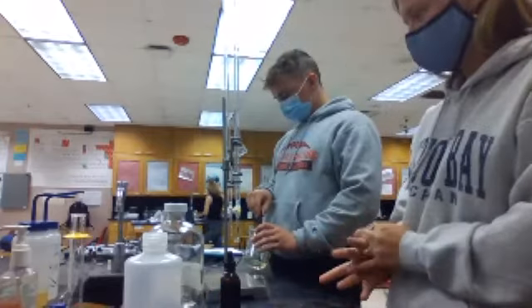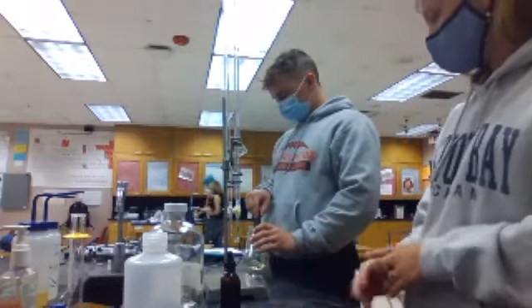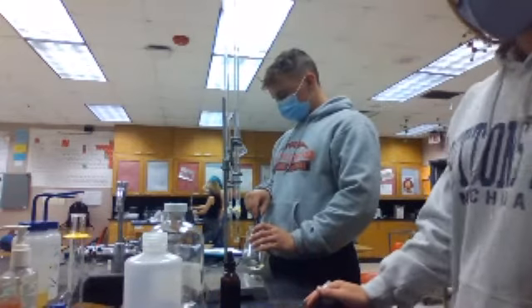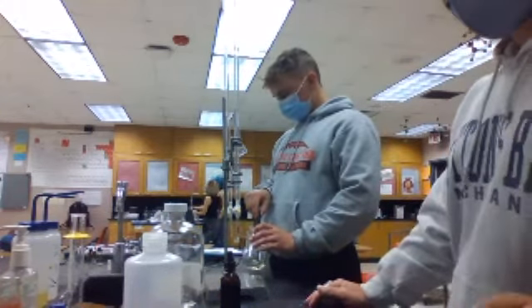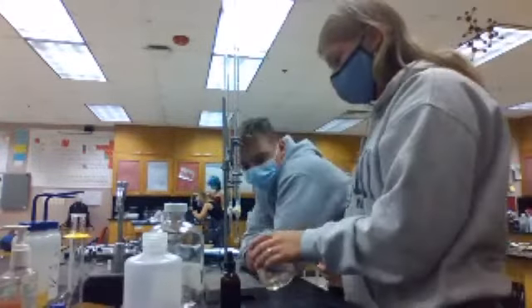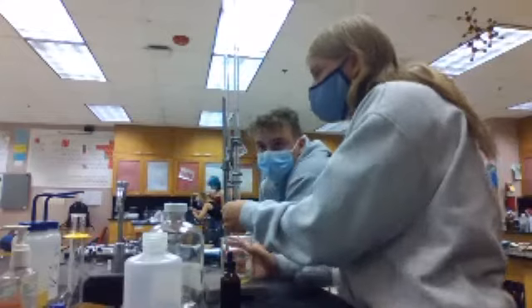Oh, no, hold on, it's still going up. It's still going. Keep watching. I know, it just went from like yellow to just. 1.27. 1.27 for 4 milliliters. And it keeps going up.